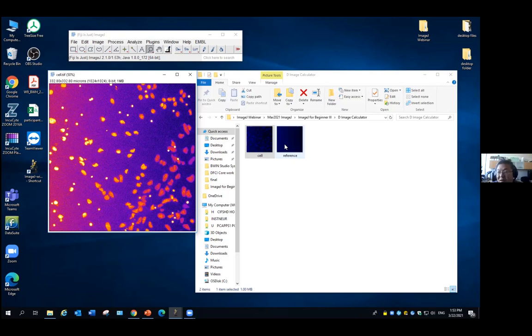And after those processes, you can analyze the image and adjust the thresholding to get a nice mask. All we did here is to help us get a nice mask image. Once you get a nice mask image, you use analyze particles. You can automatically get the ROI of your objects, and then you can do all the calculations you want. Remember to apply it on the raw image after you get it.